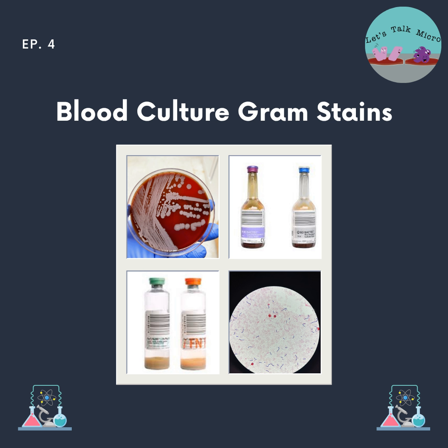As we begin this episode, let's do a quick recap. At this point in time, you know how to prepare a slide based on the source. You know how to fix it, right? I went over two methods, heat fixing and methanol. You know how to stain it. You know the reagents, the four, right? Crystal violet, iodine, decolorizer, and safranin. You know how long you apply them for. And then you know that after that, you let your slide dry and you then take it to the microscope.